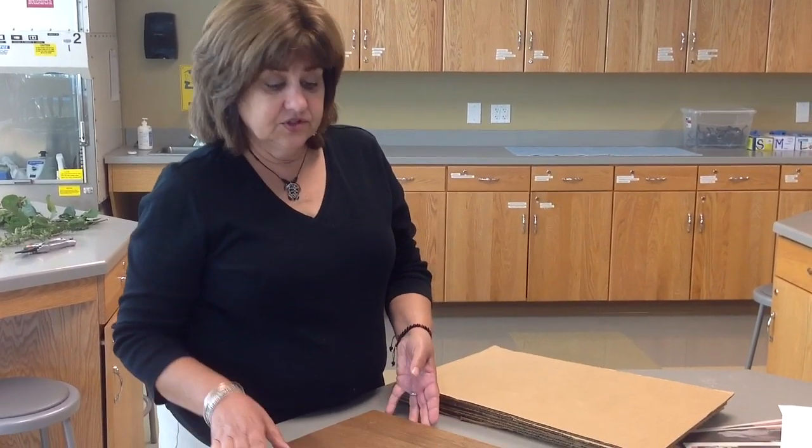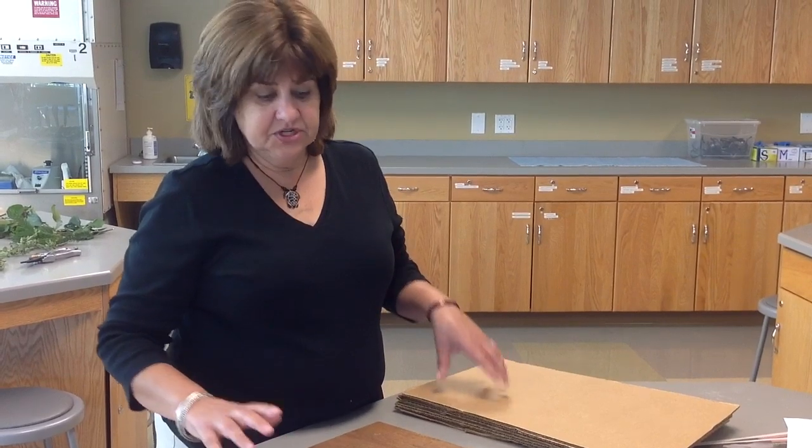Today we're going to be covering how to prepare samples to press them in a herbarium press. The first thing you'll want to do is gather the herbarium press materials together.